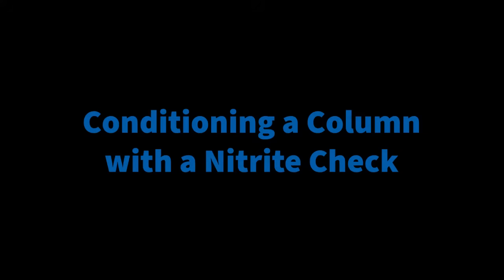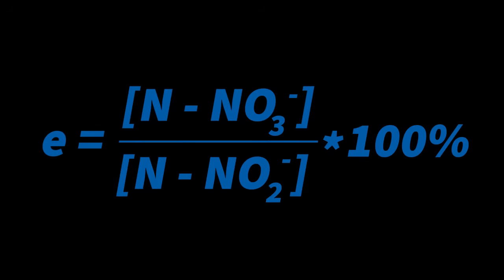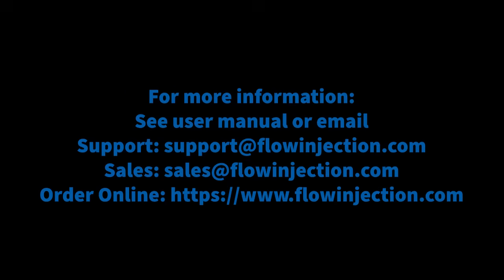It is recommended to run a quick conditioning run followed by an efficiency check after installing a new column. To do this, simply run 10 injections of your highest standard, followed by your nitrate to nitrite checks. Efficiency is calculated by dividing the nitrate response by the nitrite response. Generally, you want to see an efficiency of 90% or higher.